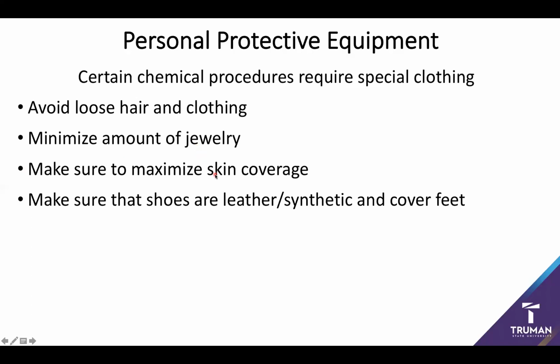Similarly, when working with shoes, one of the things that you should try and make sure is that all of your shoes are made out of either leather or synthetic fibers, as this will help prevent, say, damage from several chemical species. And most importantly, a lot of the cotton shoe covers can essentially hold chemicals against your feet. And so essentially covering your feet with these leather synthetic fibers is going to have much more chemical resistance and be less likely to result in injury.